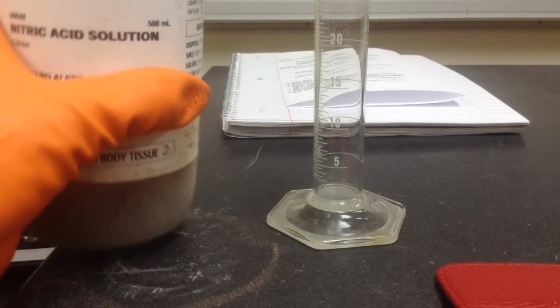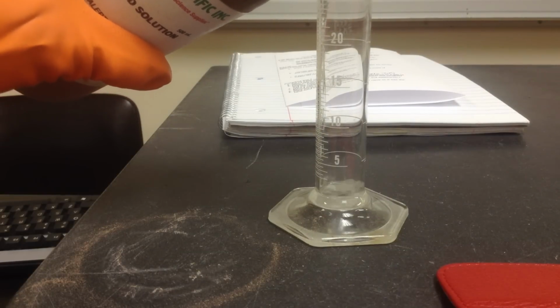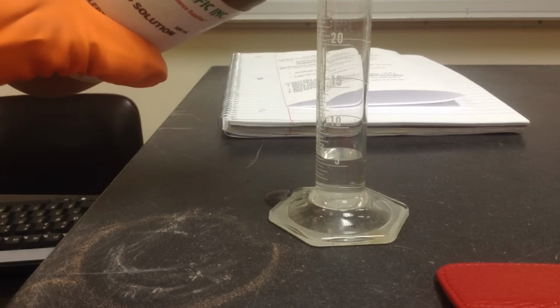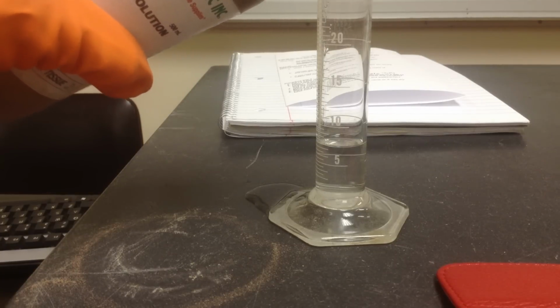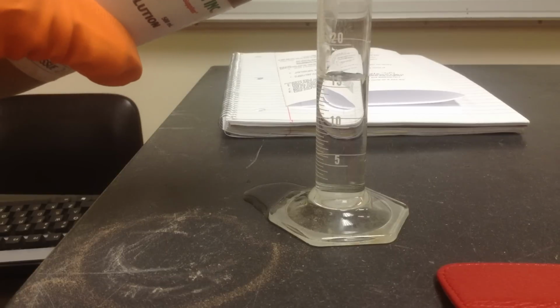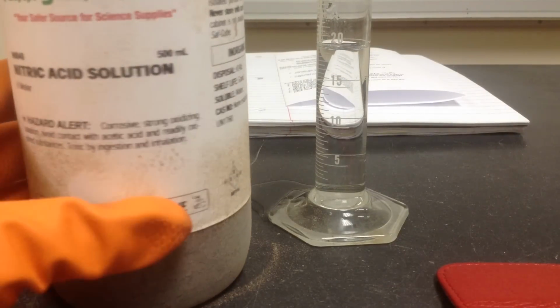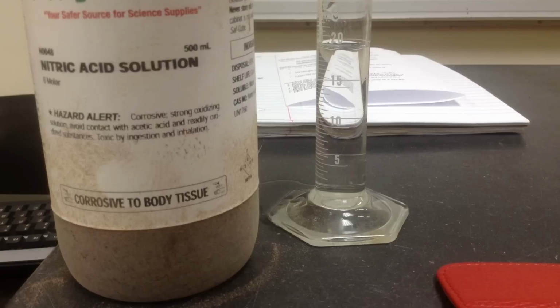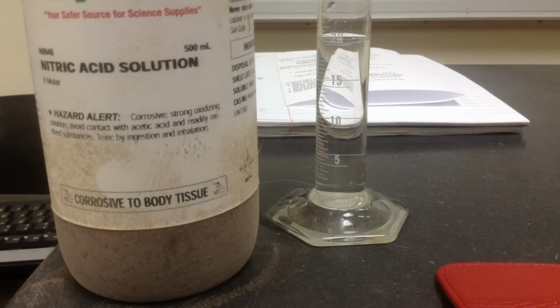And I need the bottom of the meniscus to be at the 20 mark. And that is at the 20 milliliter mark.